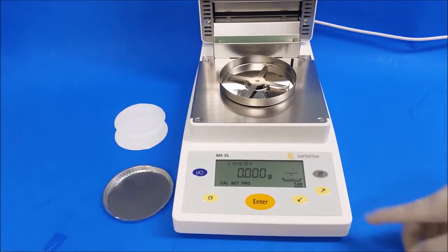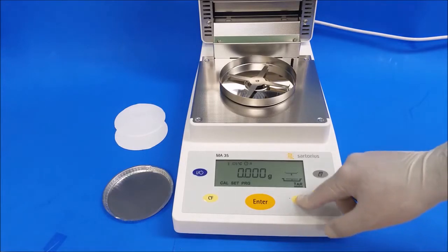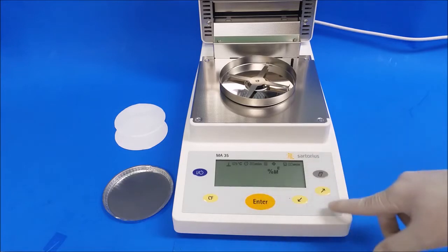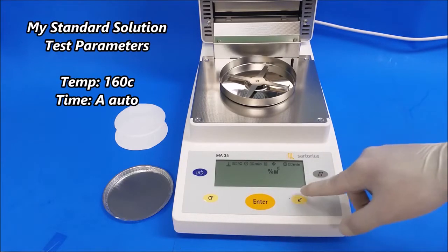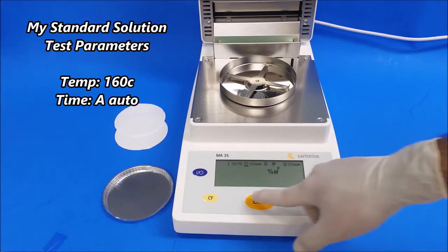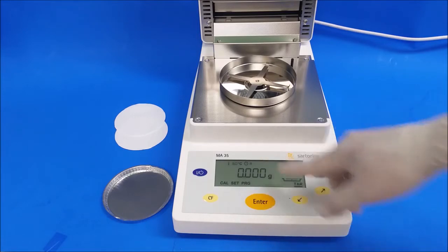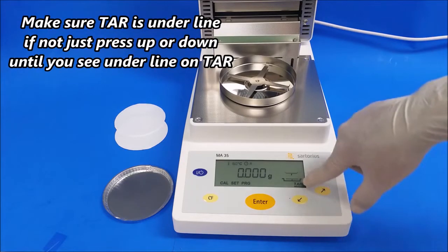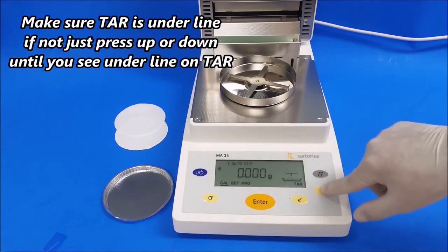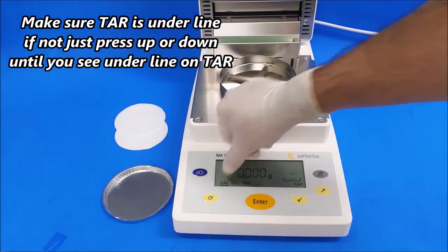Now I'm going to change the test parameters because I need to run a standard solution test. Go to program, enter. I already have it at 160 and it's already on auto, and you're going to make sure when you're going to tear, you have to be underlining tear, so make sure it's not underlining tau.